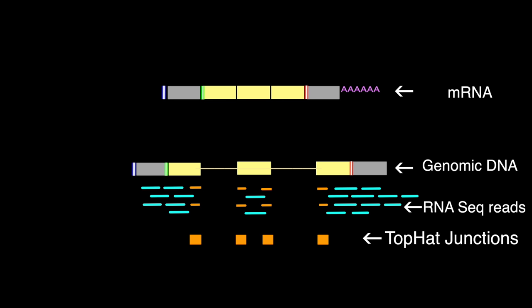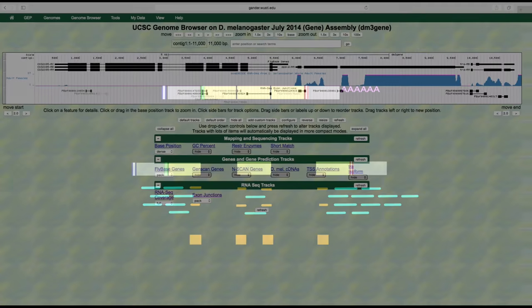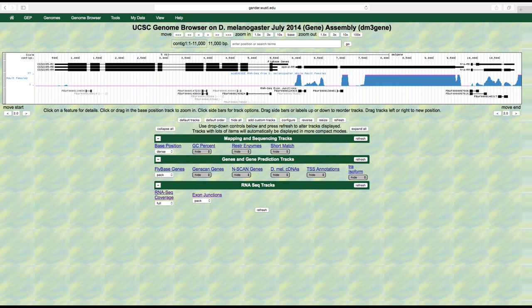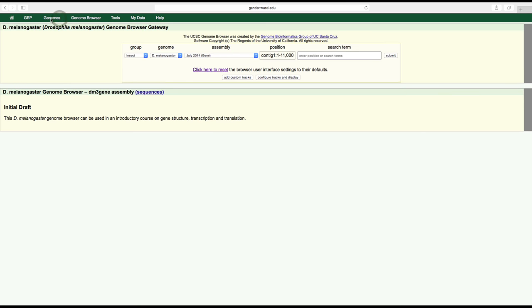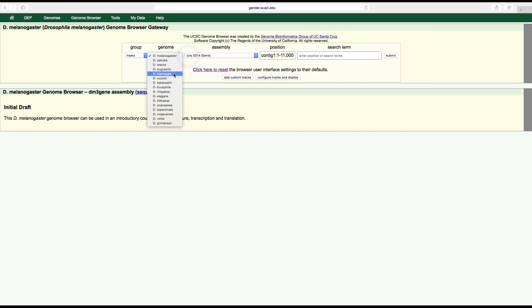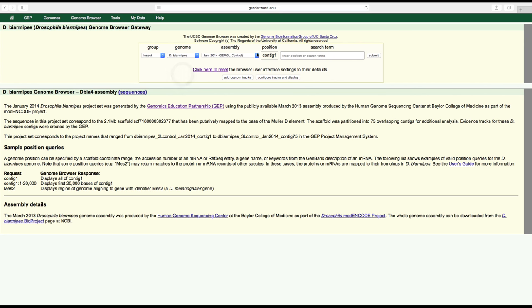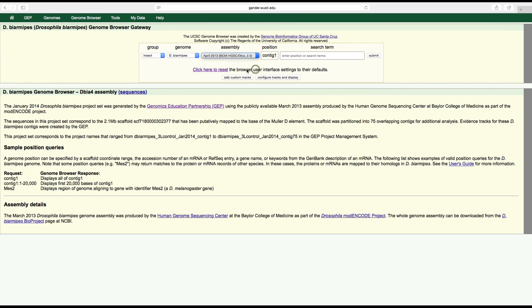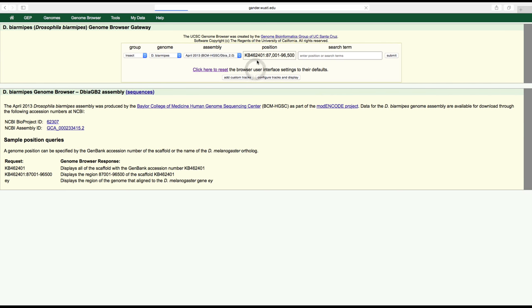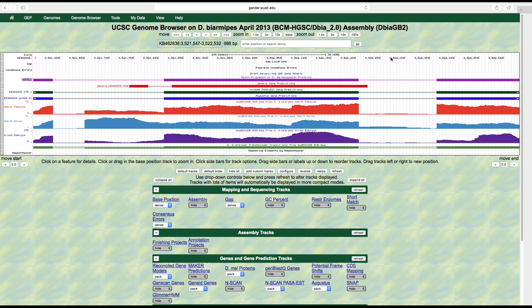To illustrate, let's view the RNA-seq data for a different Drosophila species. Click on the genomes link on the main menu bar to return to the genome browser gateway page. Change the genome field to D. biarmipes, the assembly field to April 2013 BCM-HGSC-Dbia-2.0, enter tra-pa into the search term field, and then click submit.